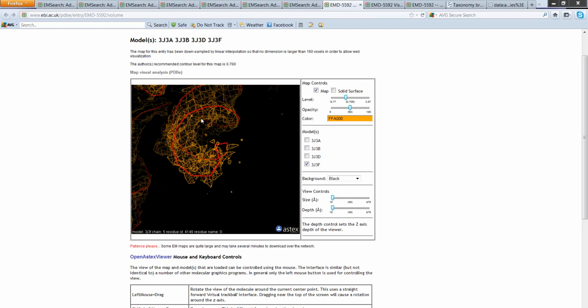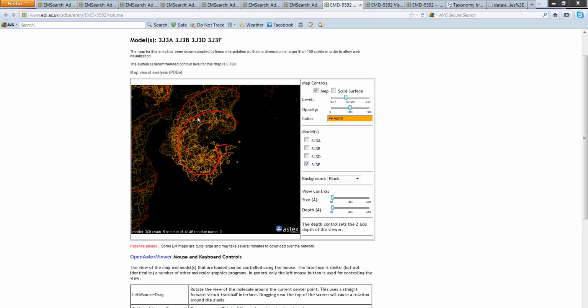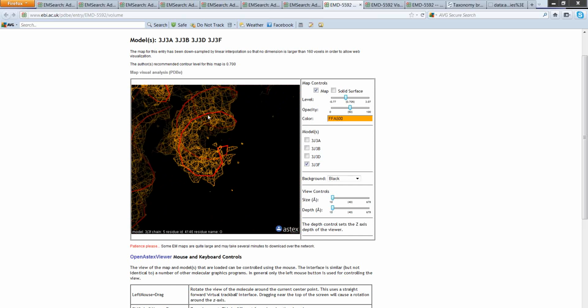And you can also start understanding the atom inclusion plots that we have seen, because you can see that the backbone is along the edges of the density, so it would not be uncommon that some parts of this may stick out of the density, but you can see that the bases would be sticking into the density.